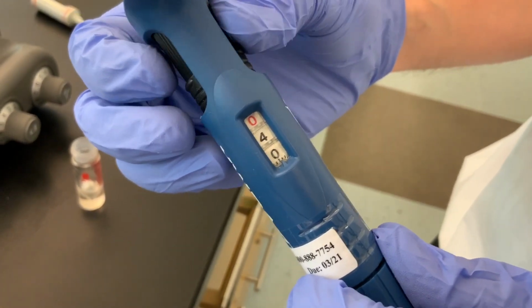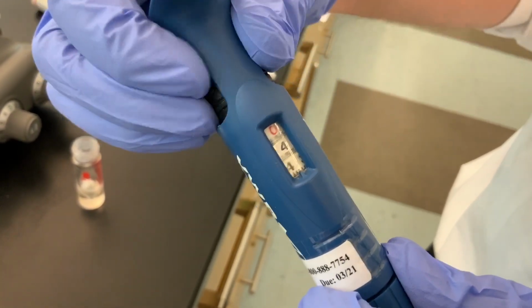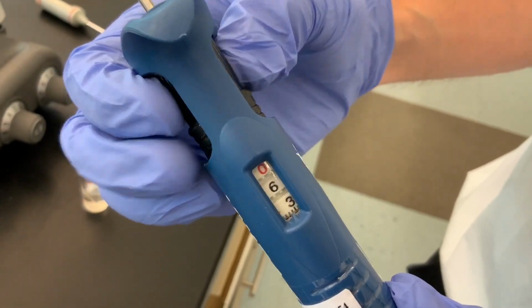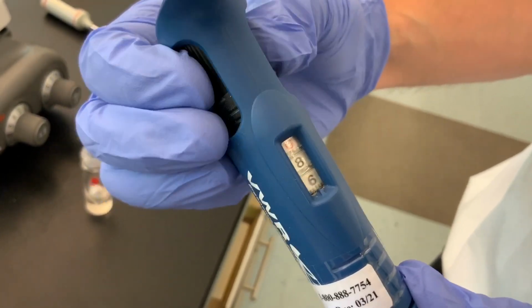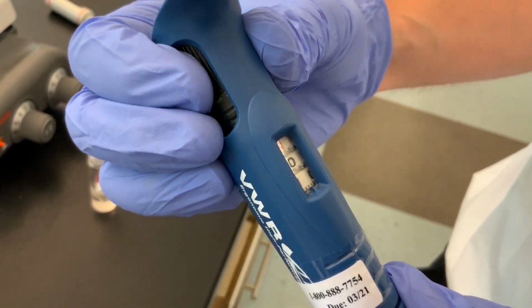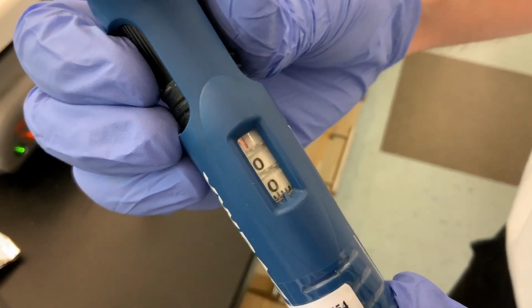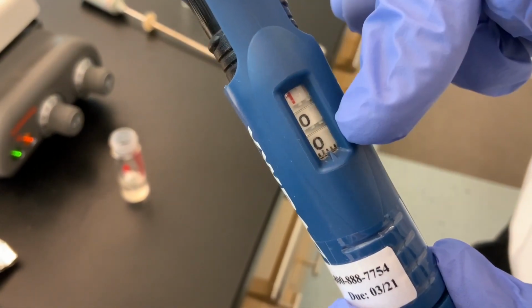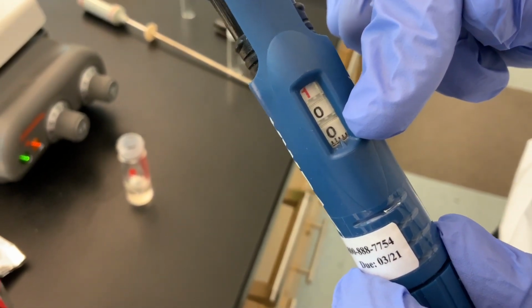So right now, it's set to 400 microliters. And I'm going to keep climbing, obviously, because I want to get to 1,000 microliters. And it will say 1000, and it's going to be red because that's the maximum capacity of this particular pipette. All right, so 1000, I'm trying to get the line just so where this is pointing to. And so this is now 1,000 microliters, aka or equivalent to 1 milliliter.